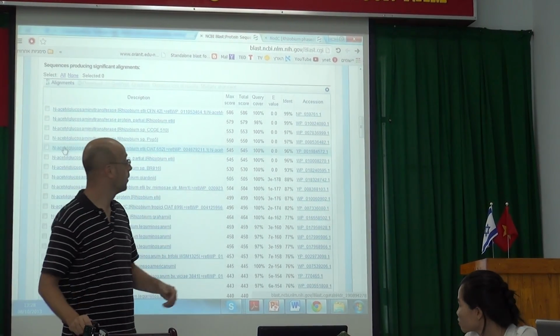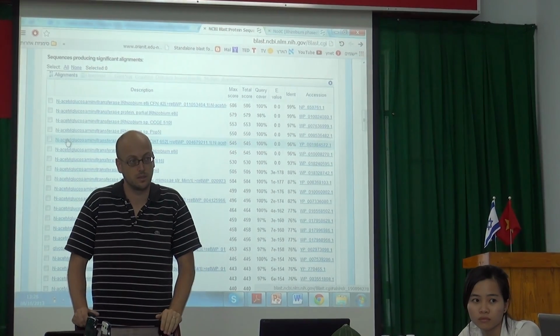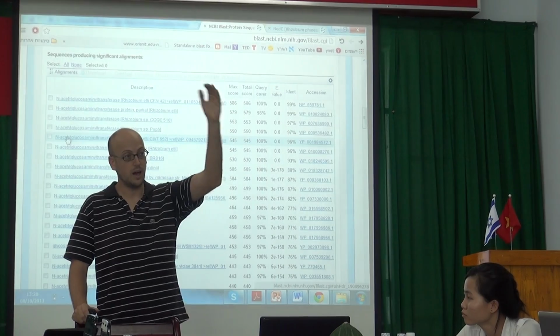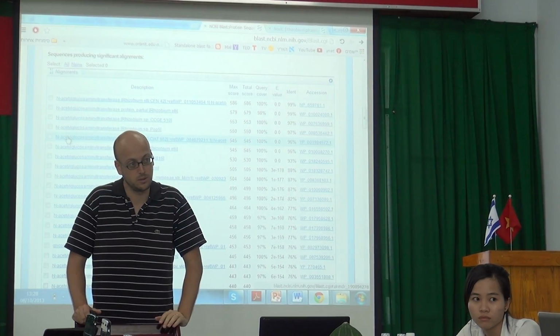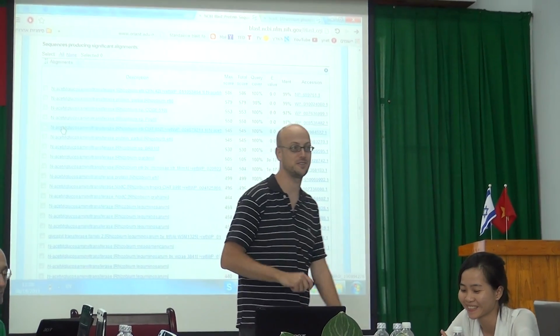High score. Will I choose one with a high cover or a low cover? High cover. High e-value or low e-value? Low. Perfect. You can be a professor.